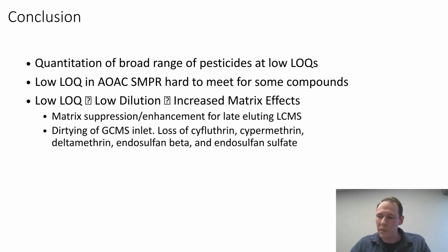One other thing that I should mention as well is that I did see some issues with the GCMS inlet getting dirty after repeated injections, and so I think that a further dilution could also benefit there as far as the GCMS repeatability.